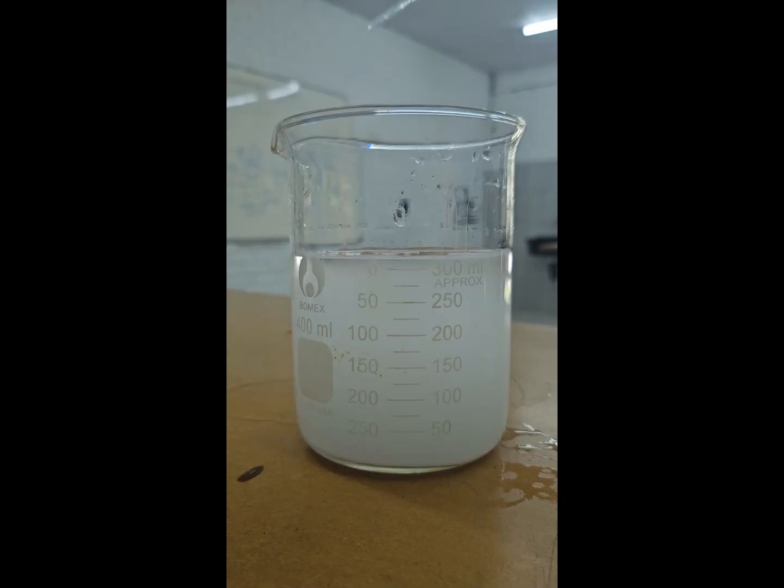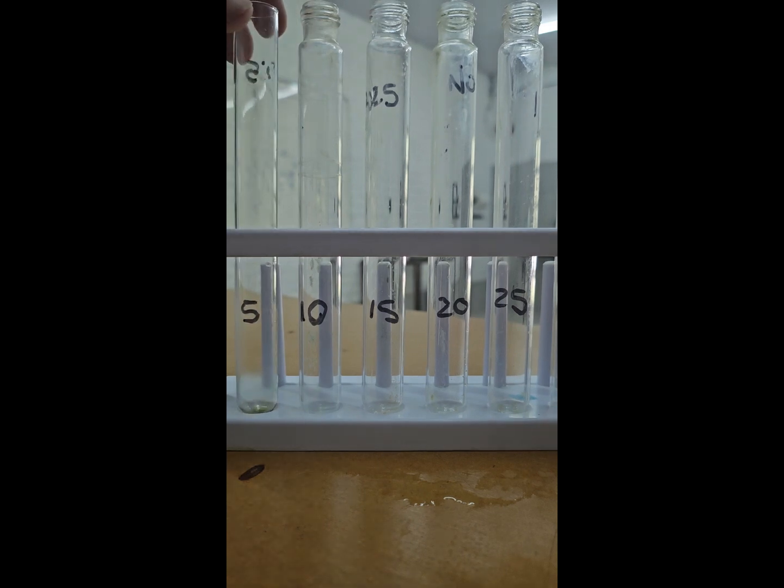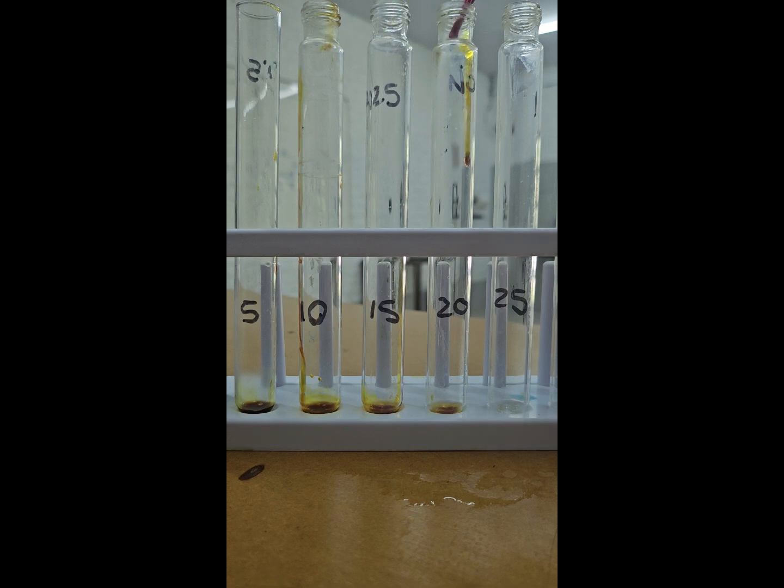So in this experiment, I have my starch solution. I will then add my amylase enzyme to my starch solution. At this point, I would already start my timer to time how long my starch solution and enzyme have been in contact with each other. Here I have set up test tubes with different time intervals. The first time interval is 5 minutes, then 10, then 15, then 20, then 25, and then I have 30 as well. That's a bit out of the camera view at the moment.